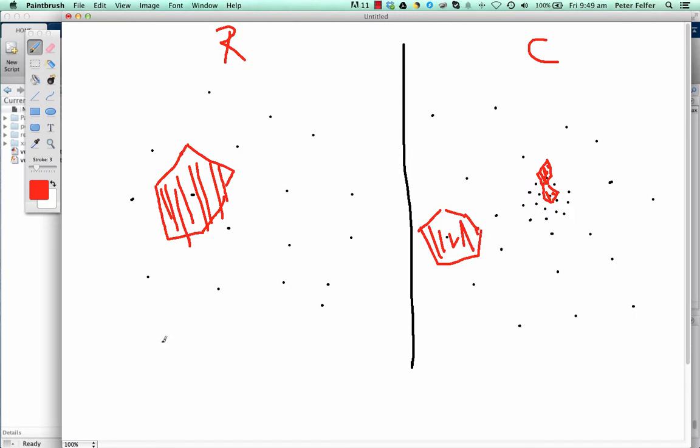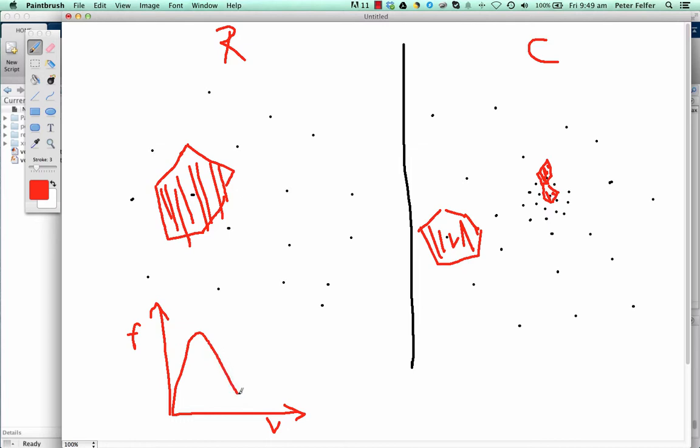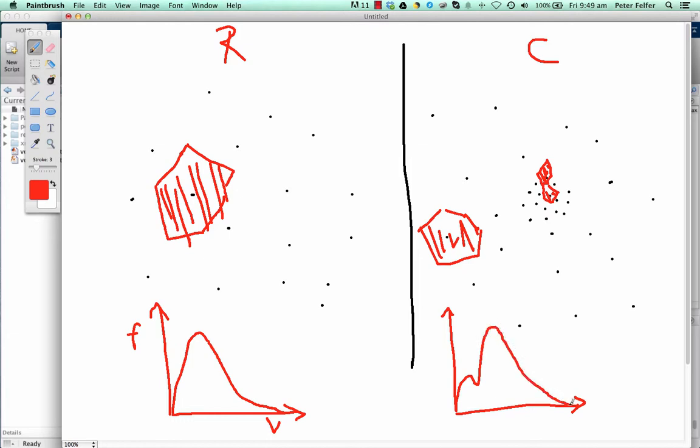If you plot a histogram of cell frequency versus cell volume, you get something that looks like this. There's no analytical expression, but there's very good numerical expressions to describe that. Here, you'll get something where small size classes are more abundant, and then you'll get another one for all the random ones. It gives us the opportunity to actually distinguish between the atoms that are in a cluster and the atoms that are not.